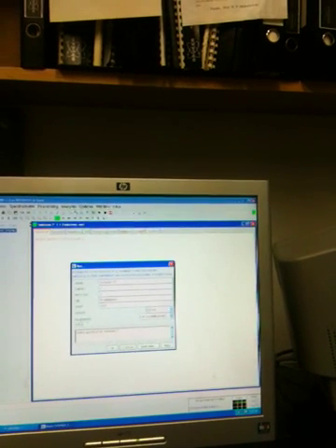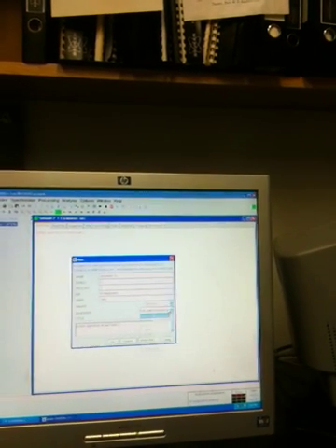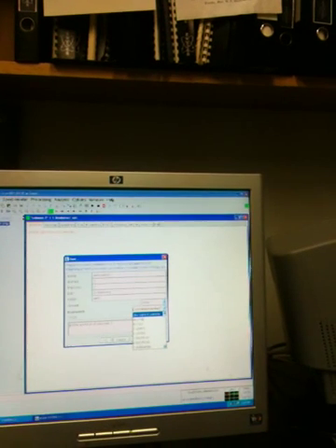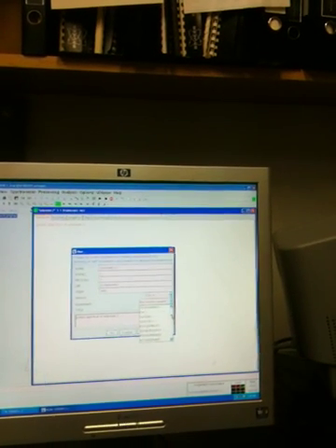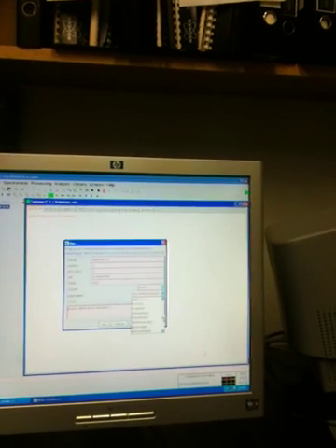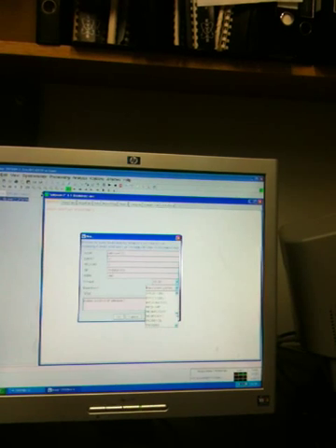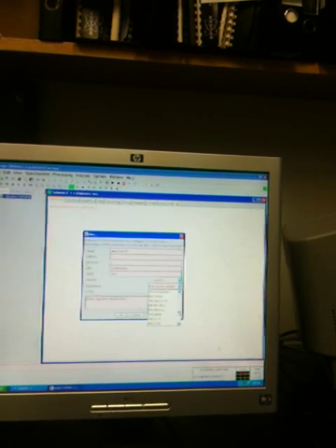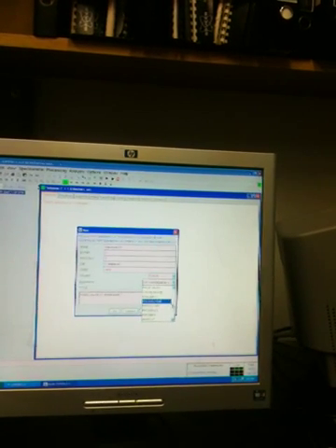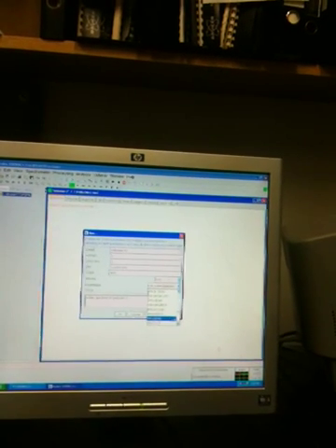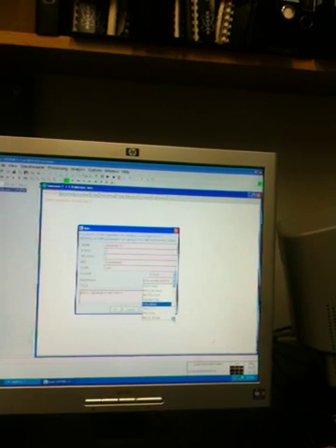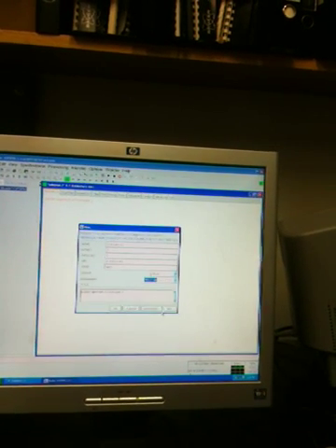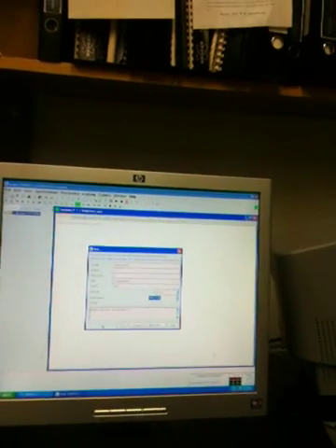It says use current parameters. We actually, the experiment we want to run is called a proton. We're going to be studying the protons in the sample. You would scan down to proton, which is right here. Oops. I lost it. A little lower. You've got to get the right experiment. Proton. That's what it's supposed to do.